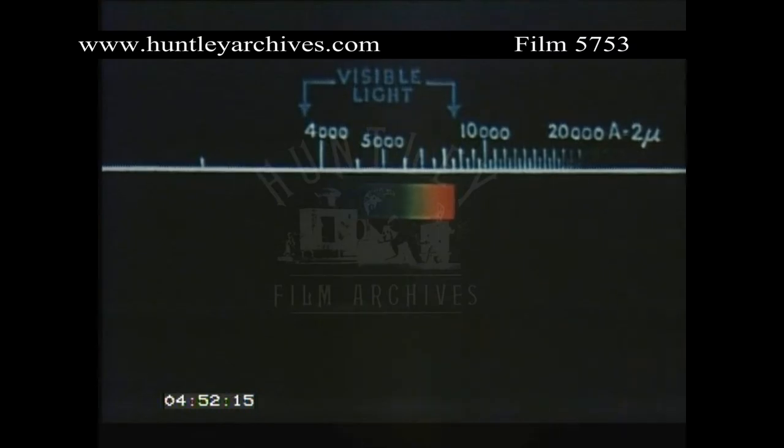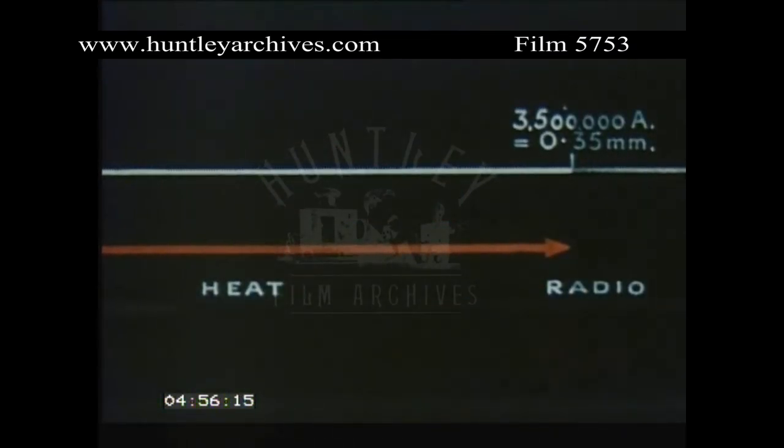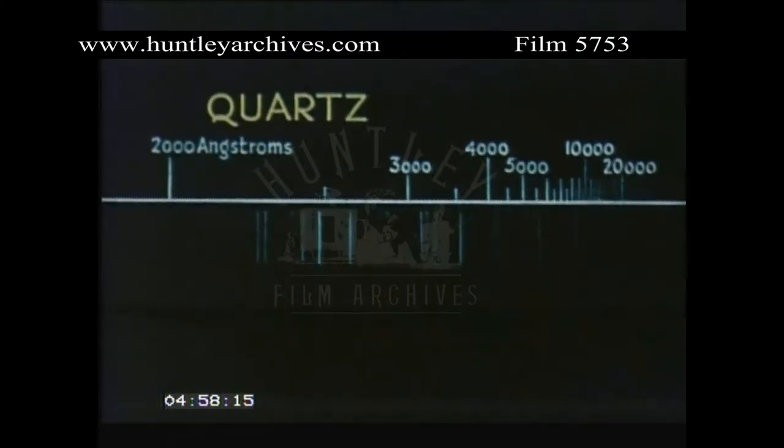And in the infrared, to overlap the region of short radio waves. For most analytical purposes, a range of 2,000 to 10,000 angstroms is more than adequate, and the quartz spectrograph is the instrument most widely used today.